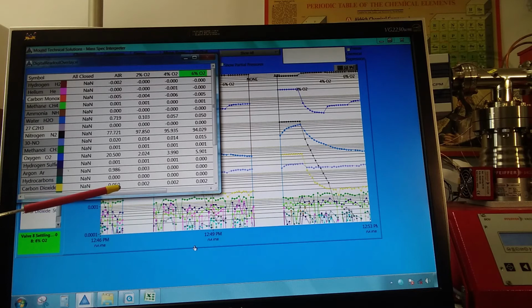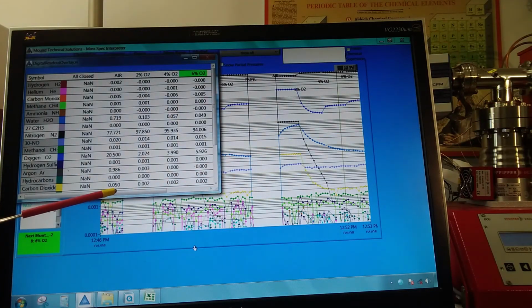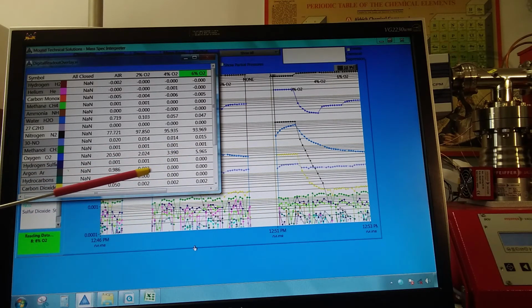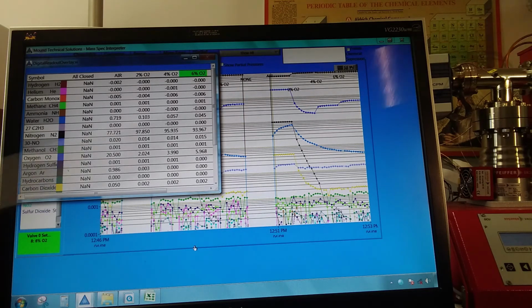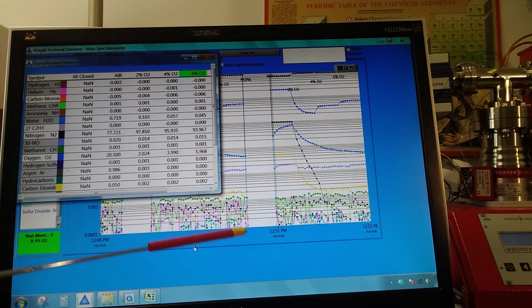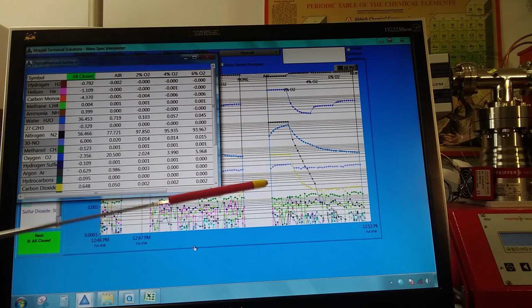The carbon dioxide in the room air capillary out here is 500 parts per million, which is to be expected. But you'll notice that we really have 20 parts per million, which is very low carbon dioxide coming from the manufacturer's synthetic cylinder gases.